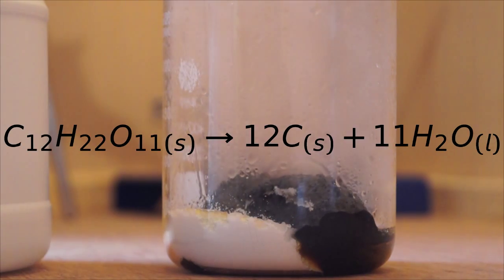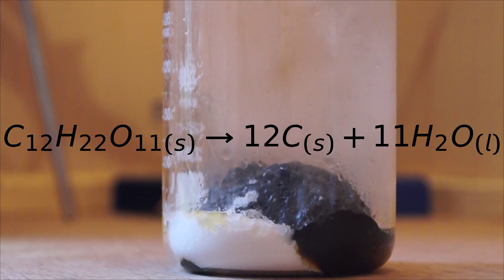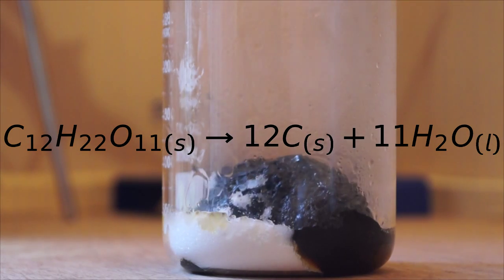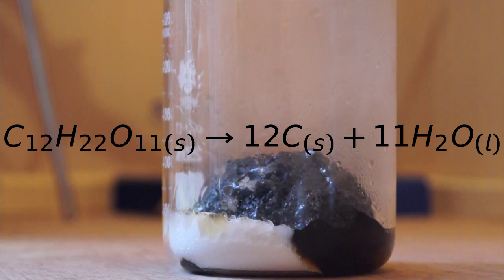The sucrose, that's C12H22O11, reacts with the sulfuric acid, the catalyst in the reaction, to produce carbon and water.